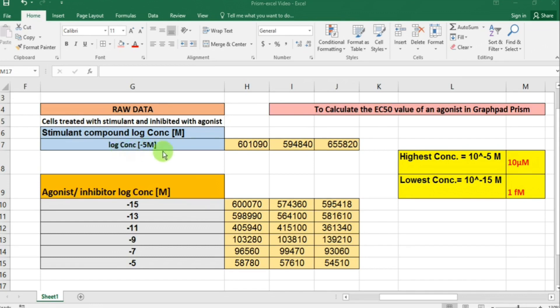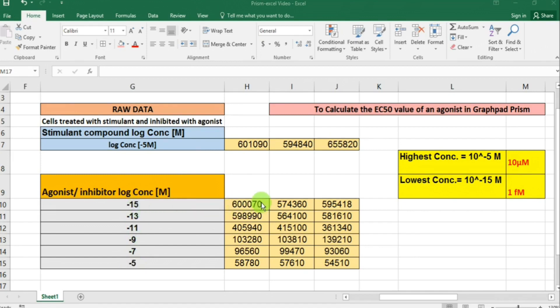I have three values arranged in triplicate. Underneath that I have values for my agonist or inhibitor drug across a range of different concentrations, starting from minus 15 molar (10 raised to the power minus 15 molar) all the way up to the highest concentration of minus 5 molar (10 raised to the power minus 5 molar). Against each concentration there is data in triplicate.